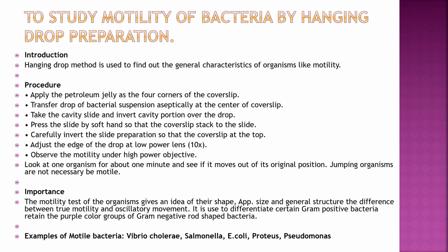Then carefully invert the slide preparation so that the cover slip is at the top and the drop is hanging, and then adjust the edge of the drop under the low power lens, and then under the high power objective confirm the motility. If the organism is moving, then it is positive.